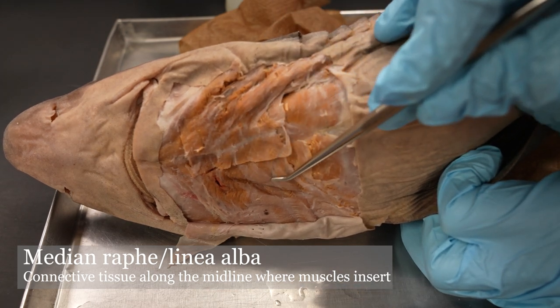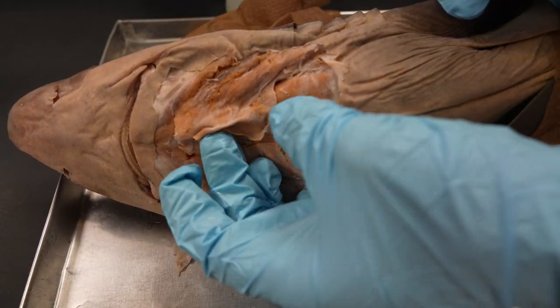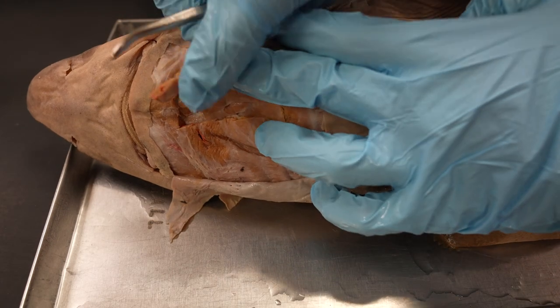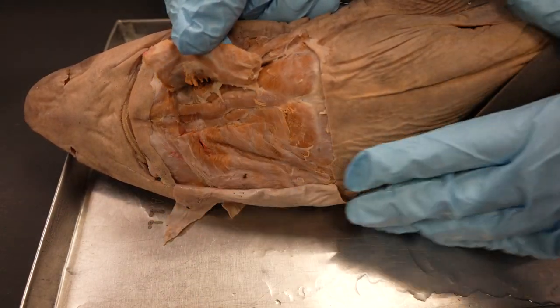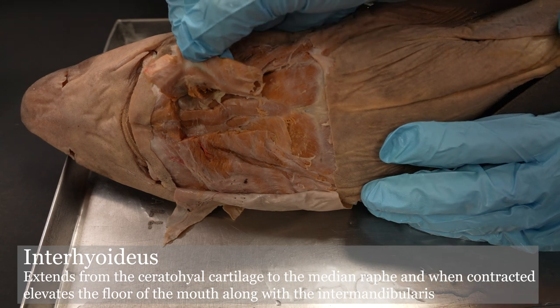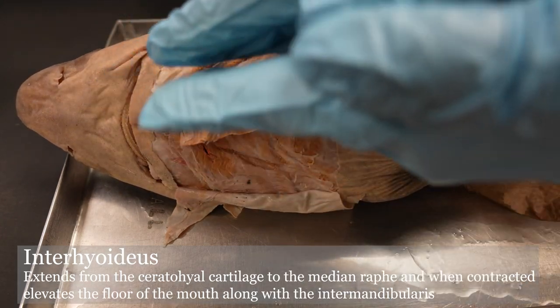The intermandibularis lies between the mandibles. If we flip it over — it's been cut, not quite bisected — the muscle that is deep to it on this surface is the interhyoideus. You're not really going to be able to split the intermandibularis and interhyoideus, but just know that they are kind of sandwiched on top of each other. Intermandibularis is superficial; interhyoideus is deep.